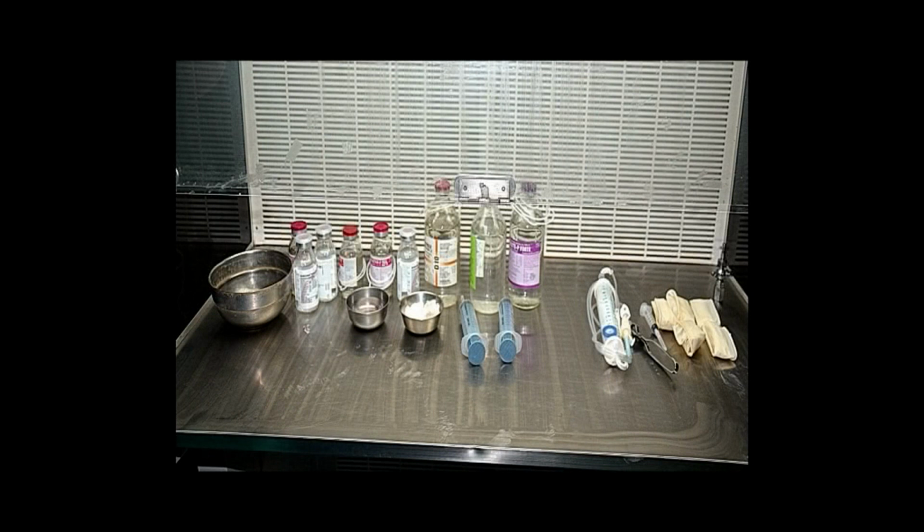Total parenteral nutrition may be defined as provision of nutrition for metabolic requirements and growth through the parenteral route. To maximize benefits and minimize complications, many centers across the world now prepare the total parenteral nutrition through a centralized pharmacy. However, in the Indian situation, it is the physician who has to take over the roles of this preparation. Total parenteral nutrition is technically demanding, it is expensive, and has several side effects.